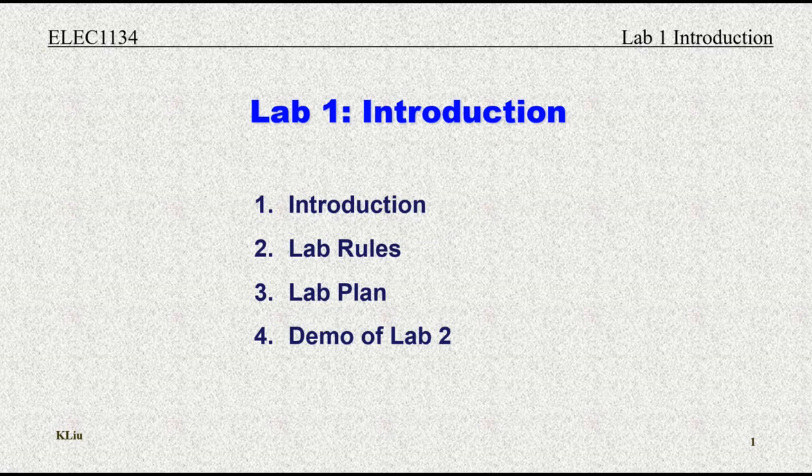This week is the orientation week. We do not go to the lab yet, but we will watch this video to learn the lab rules and the basic lab requirements. After watching this video, you need to complete a short quiz to obtain the mark for Lab 1. This video includes 4 parts. 1. Introduction. 2. Lab rules. 3. Lab plan. 4. Demo of Lab 2. Let's move on with the introduction.